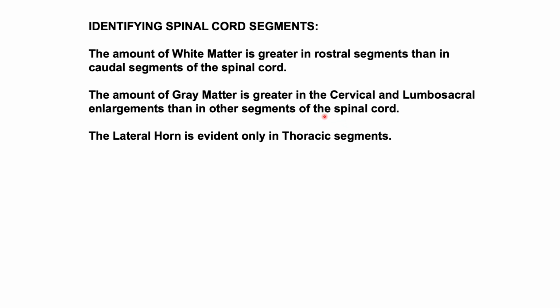Why? Because in the cervical enlargement, you have the brachial plexus. So that one will give you a lot of motor innervation within the gray matter.